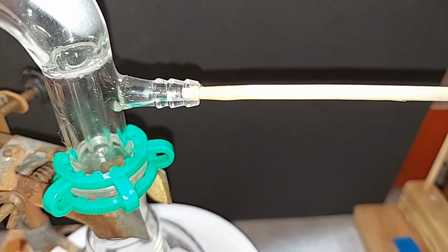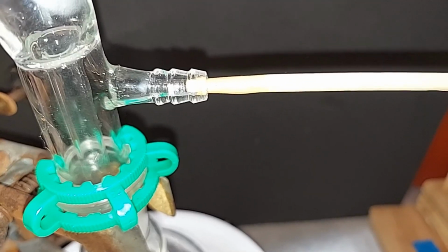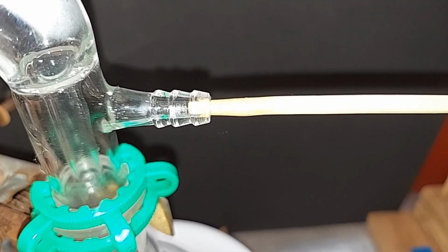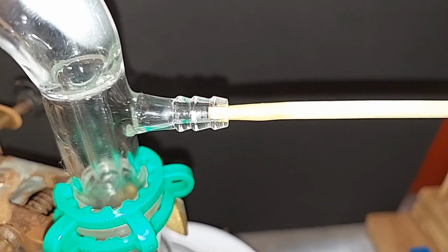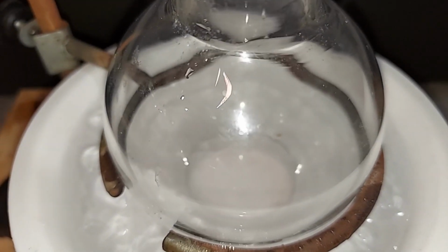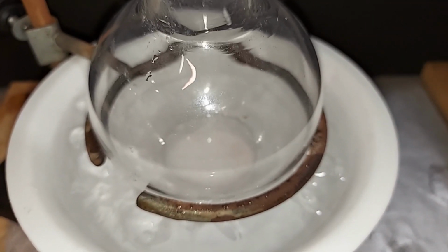Plastic syringe was not working, so I took a piece of wood and dipped it into some mineral oil and stuck it in there, and you can see what's leaking out the sides there as the mineral oil kind of pops and does these little bubbles. So yeah, we're losing something. Some of the pressure is natural, but I think out with that is going our formaldehyde, although I think it is helping. There's a little bit more in there than before, so at least it slowed down the evaporation.